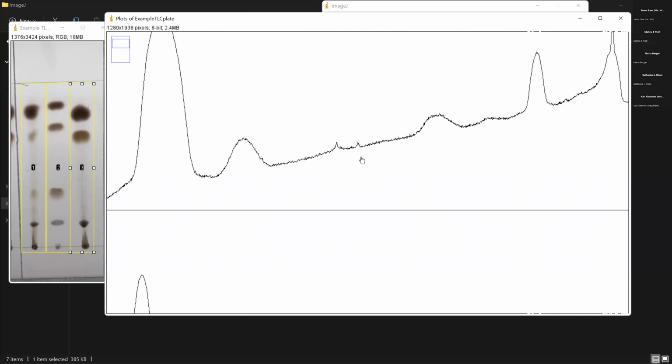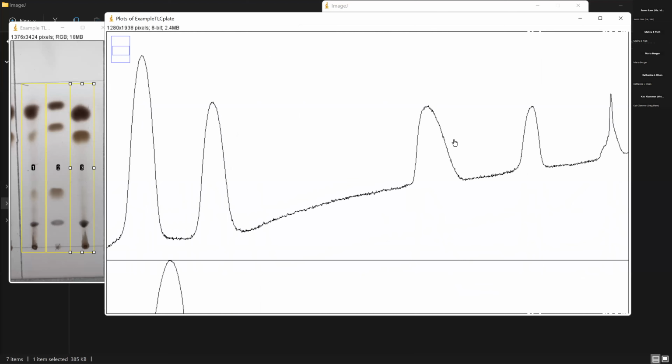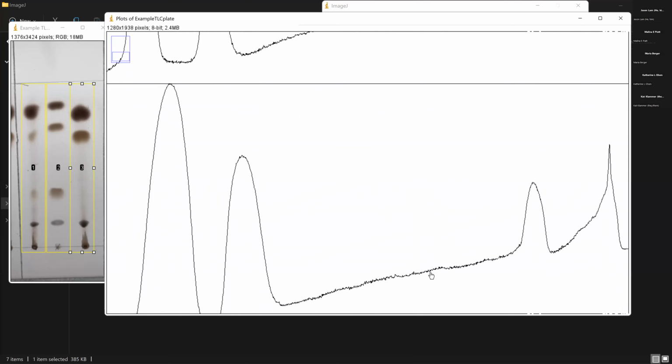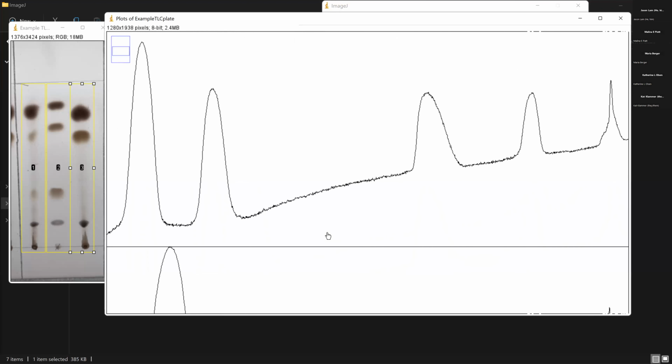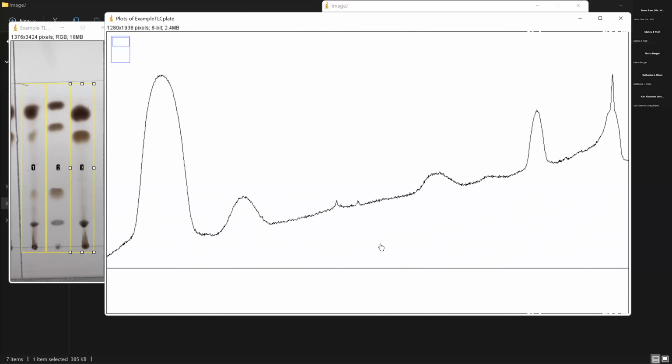Sometimes, if you remember how we asked you to wick away any of the remaining serum from the pellet at the end with a little Kim wipe, if you don't do that, you'll still see a fatty acid peak in your pellet because some of that serum is still going to be there and show up in this chromatogram. Okay, so that's a little background.